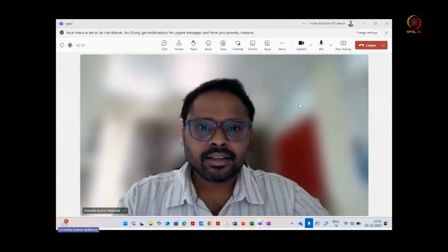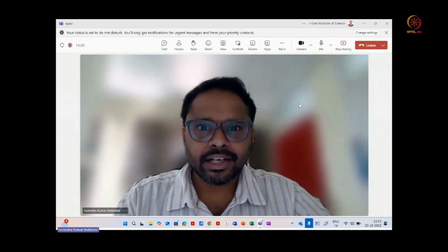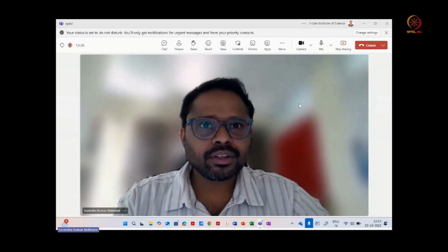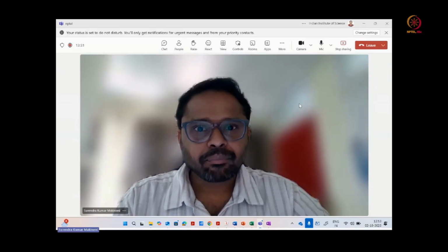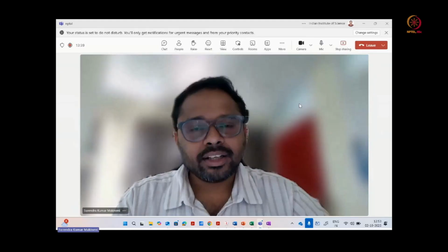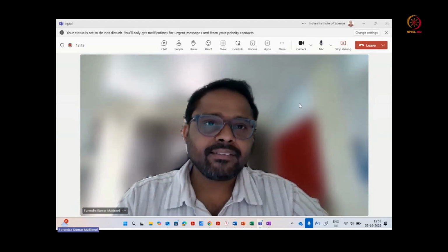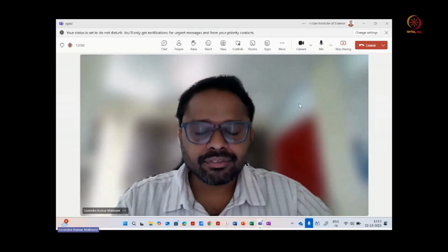Welcome to this class. In the last class, we discussed mostly the electron microscopy, transmission electron microscopy, and we covered the diffraction and also the imaging. Now in this class, I will introduce briefly the scanning electron microscope, and we will discuss the image formation. Then we will introduce electron channeling contrast imaging, and how these techniques can be used in combination with transmission electron microscopy and atom probe tomography. I will present all the applications with different alloy systems.